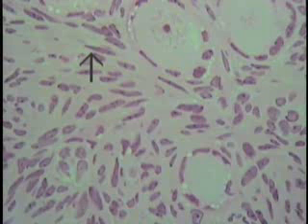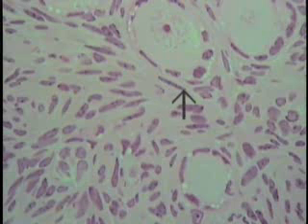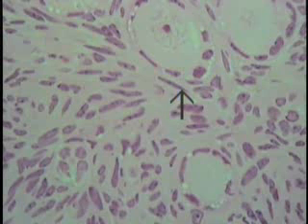In this particular case, the cytoplasmic boundaries cannot be discerned very clearly, but you can still see the shape of the nucleus quite well, stained this deep basophilic color. In this case, this is the nuclear profile.